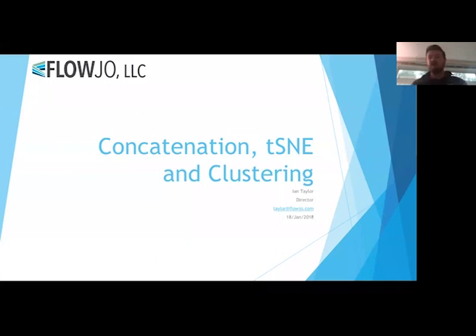My name's Ian Taylor. I'm a director here at FlowJo, and today I have the pleasure of giving you guys a demo of concatenation, t-SNE, or t-distributed stochastic neighbor embedding, and then the clustering that accompanies that in FlowJo.